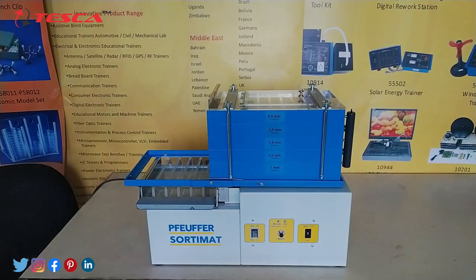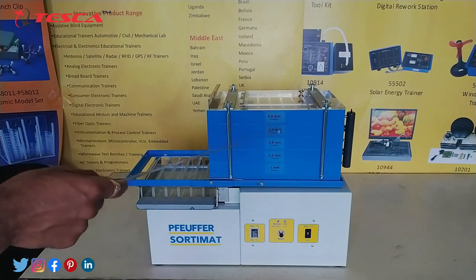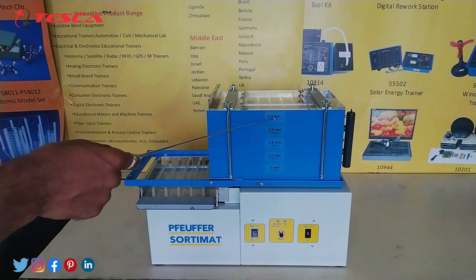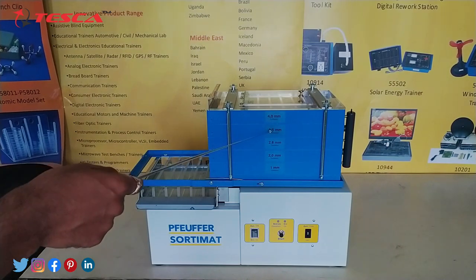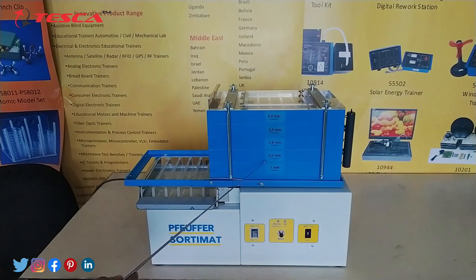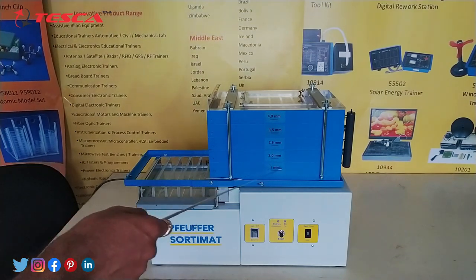Now let's talk about its body parts. This is the cover, and this is the sieve stack. There are 5 sieve stacks: one is 4.0 mm, the second is 3.5 mm, the third is 2.8 mm, the fourth is 2.0 mm, and the fifth is 1 mm.